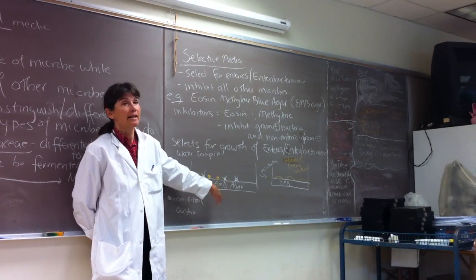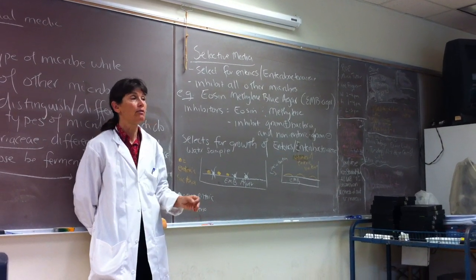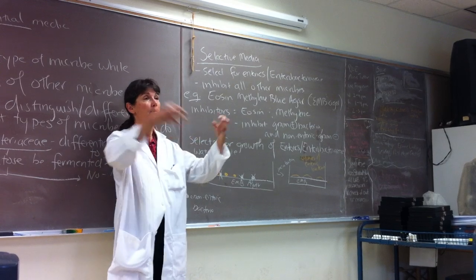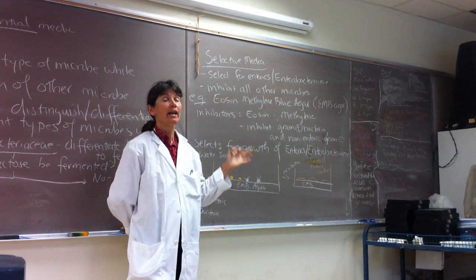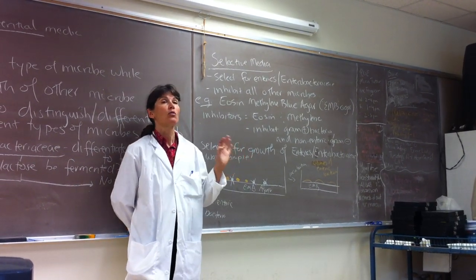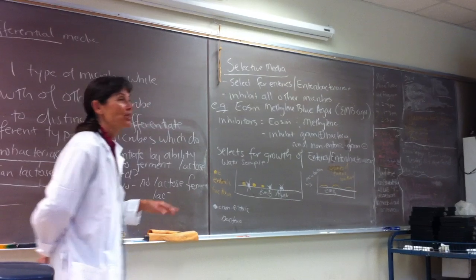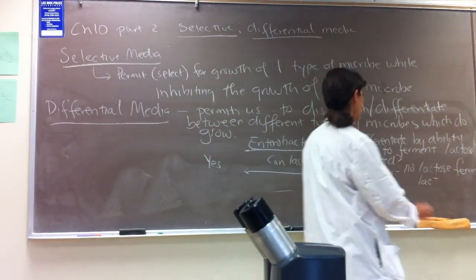So if we have enterics that can't ferment lactose, they have to tear apart the proteins instead. They use proteins as a source of carbon and energy. And when they tear the proteins apart down into amino acids, and they tear the amino acids apart, they release the amino groups as ammonia. And you might remember from chem that ammonia acts as a weak base. It can bind to hydrogen ions, and consequently, the hydrogen ion concentration goes down. What happens to pH? It goes up, right?